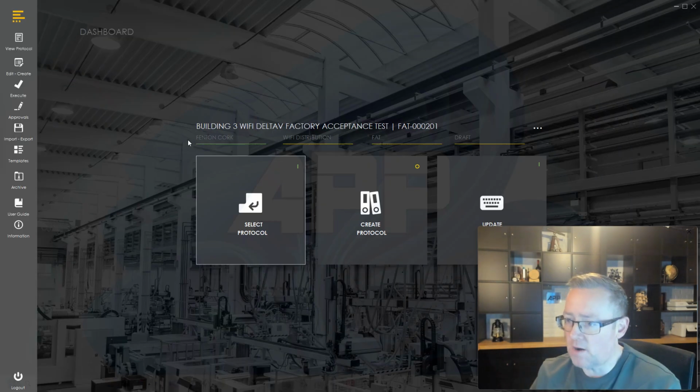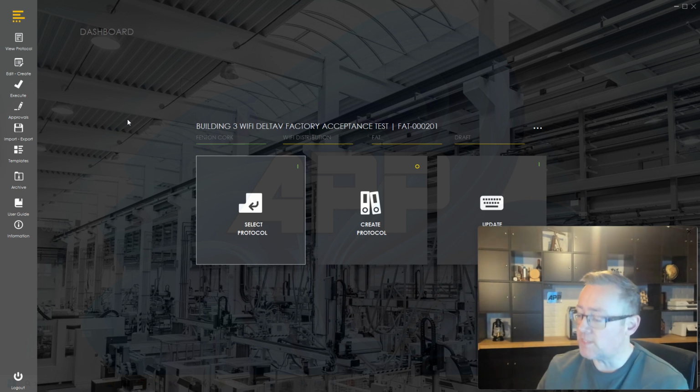So the concept of this application is that it's supposed to be a digital version of that, and it's something that I have a good bit of experience with. I have executed many protocols at different sites, and I've also used several different paperless digital protocol systems. There's not too many out there, certainly not as many as document management systems, but there are some options coming out, and I wanted to have my own. So I'll go through briefly how this application works.